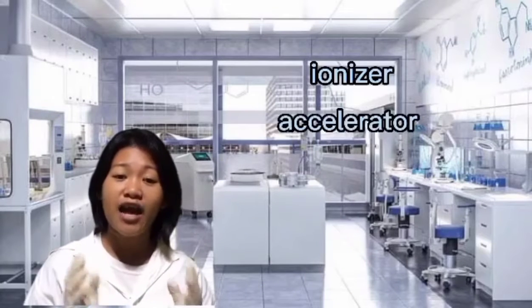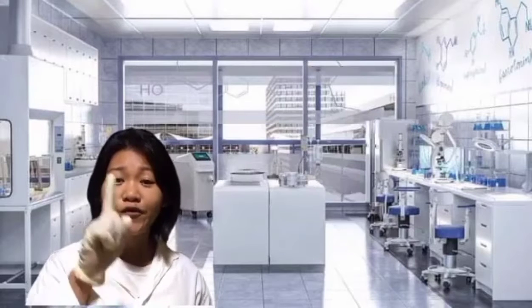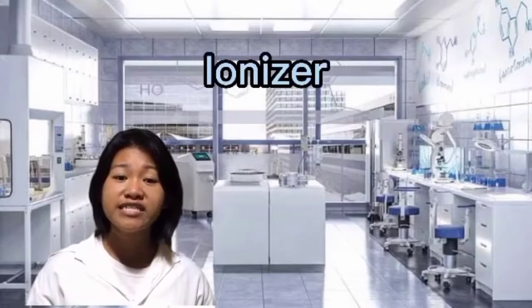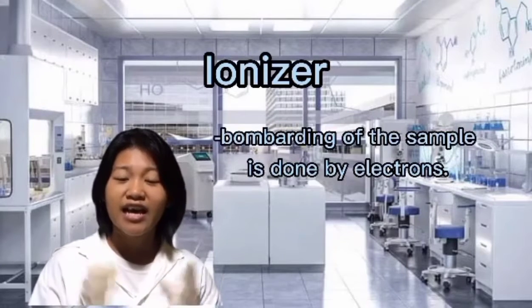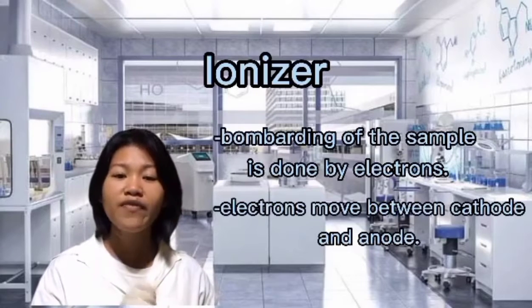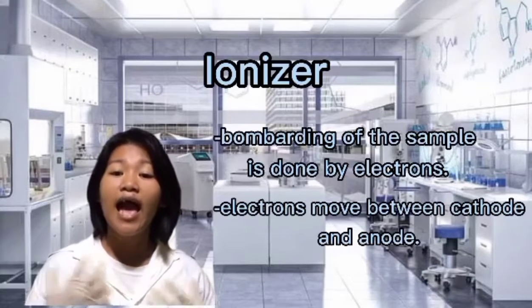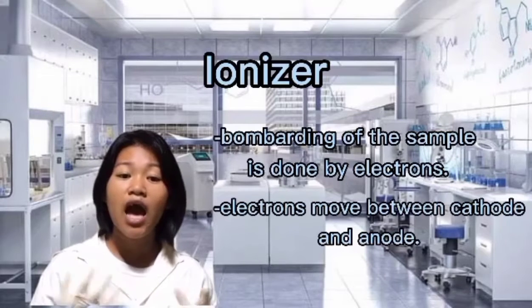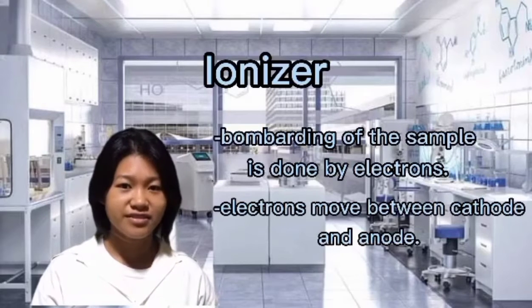There are four main parts of mass spectrometry, which are the ionizer, accelerator, deflector, and detector. First is the ionizer, where the bombarding of the sample is done by electrons. These electrons move between the cathode and anode. When the sample passes through the electron stream between the cathode and anode, electrons with high energy knock electrons out of the sample and form ions.